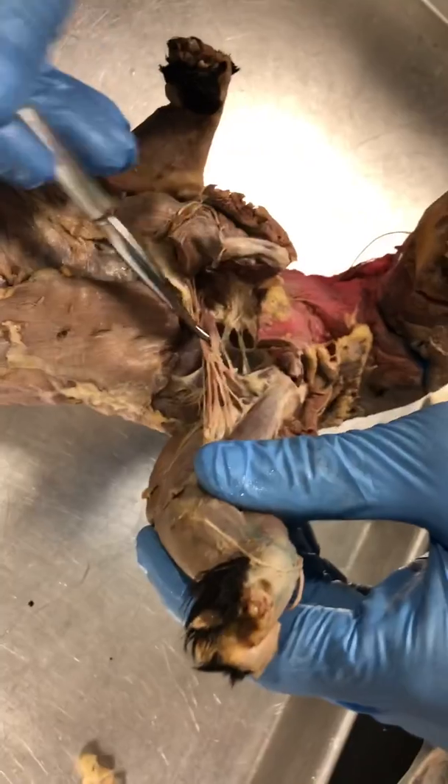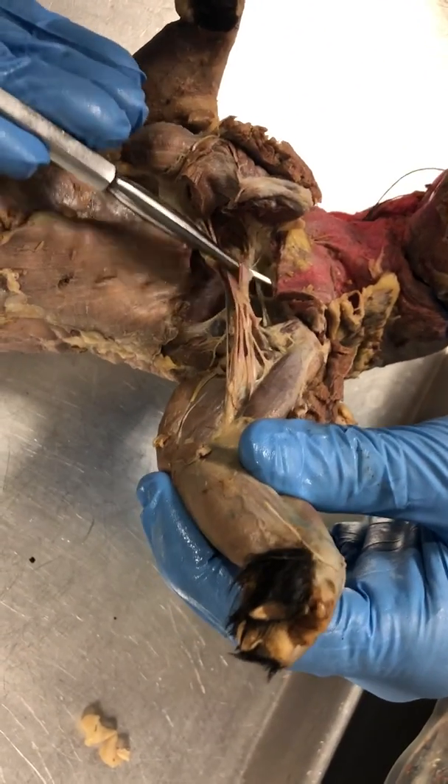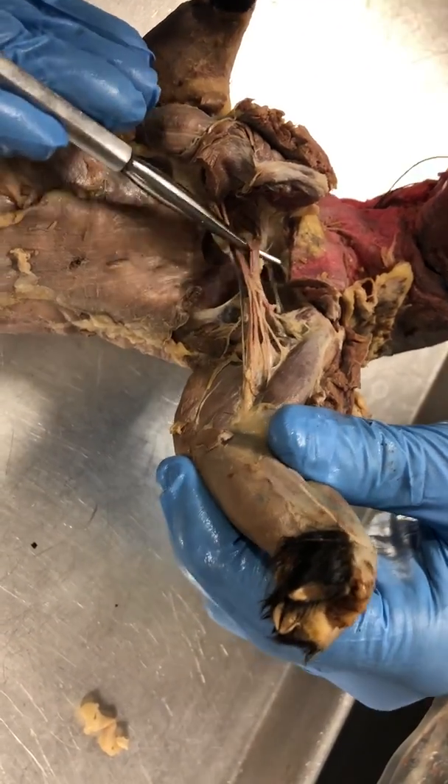Right here is the radial nerve. See how much larger that one is. So, radial nerve.